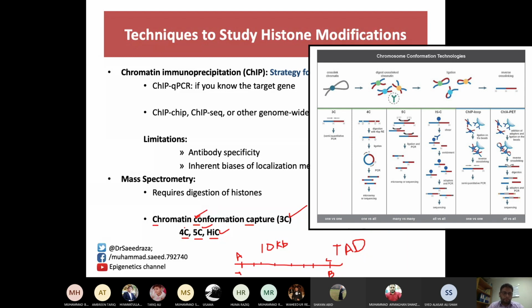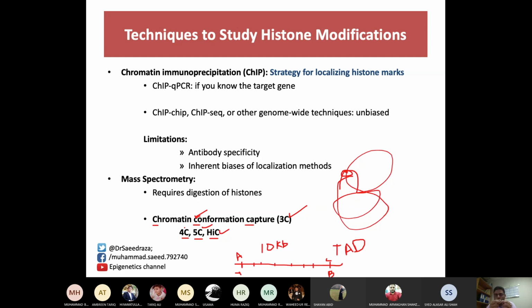Maybe some acetyl group gives us some type of fluorescence; I just wanted to know, is it possible or not? Yes, exactly. All these immunoprecipitation techniques could be used for colorimetric analysis. For example, you could go for ELISA. This will create a color. This will create a fluorescence. So you could go for fluorescent microscopy techniques. I'm going to show you in the next slides how you could do that. The only trick is that you could couple your antibody of interest with a relevant fluorescent dye, and it will create a color.